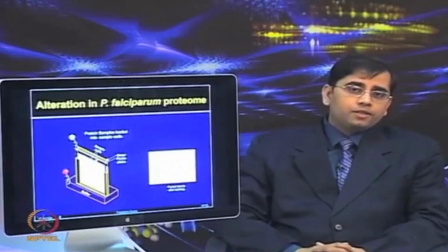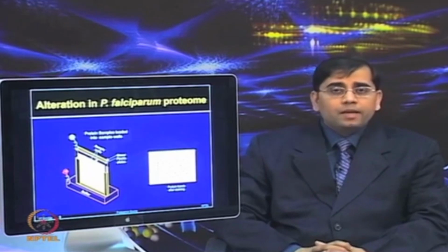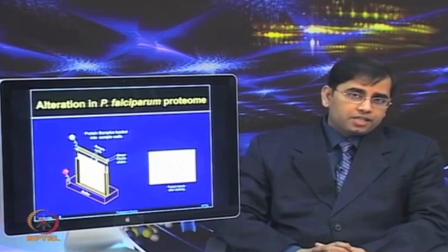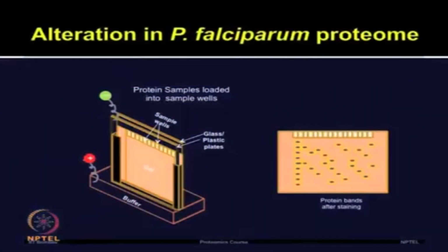Once protein extraction was done, then authors used an IPG strip of pH 3 to 10 range for the first dimension separation of proteins in the linear IPG strips. After the IEF was done, they equilibrated these IPG strips and then applied them on a 12.5% vertical SDS gel.